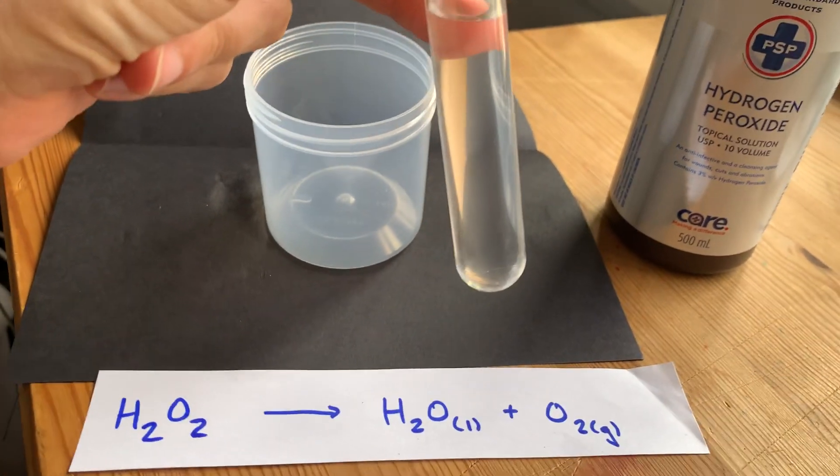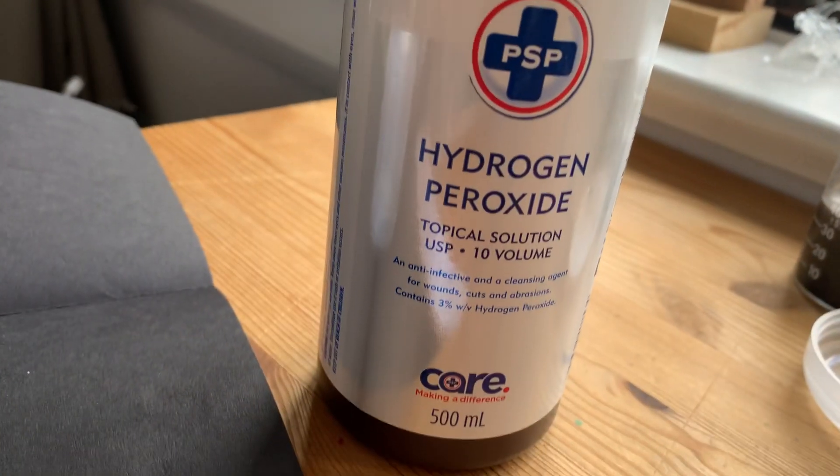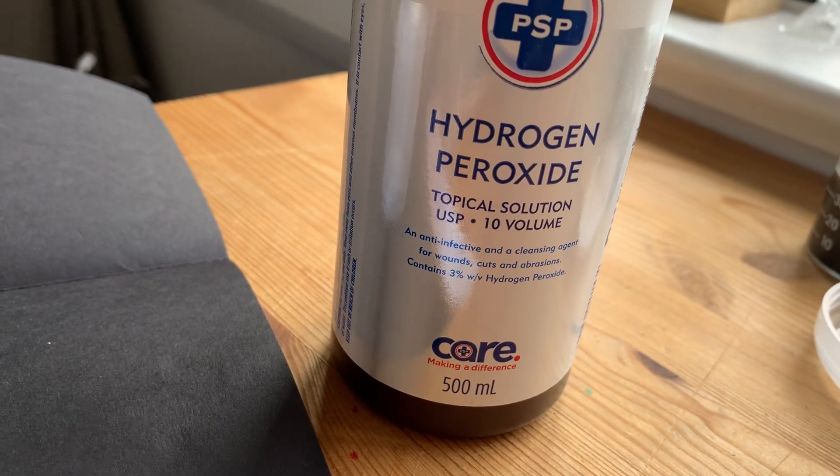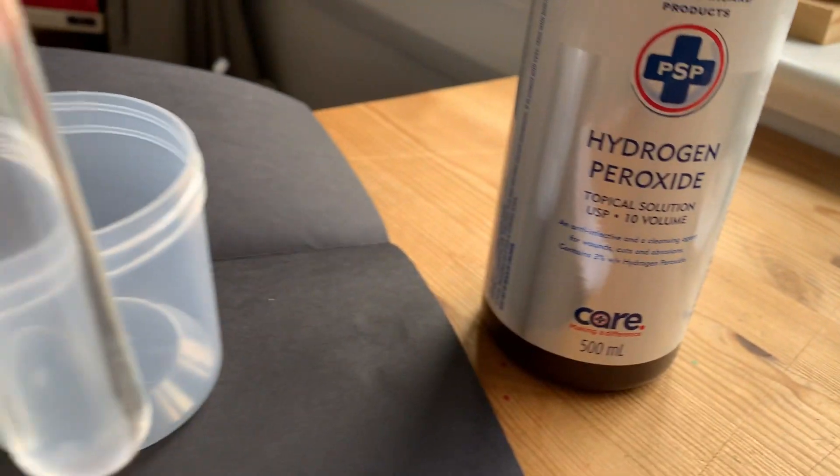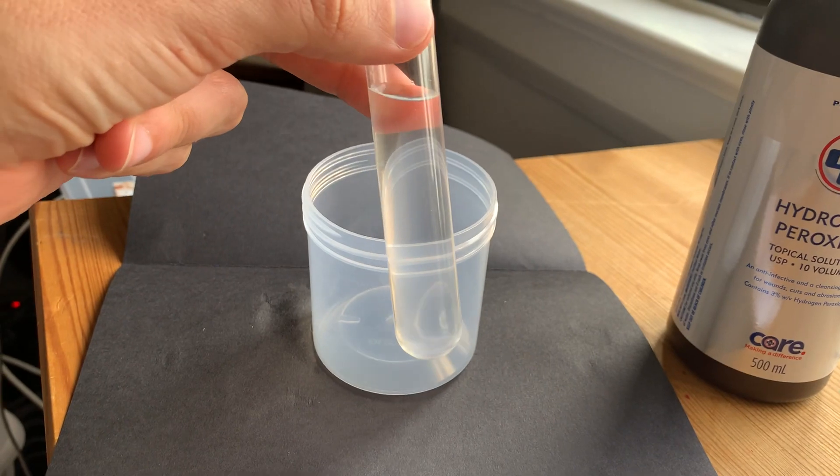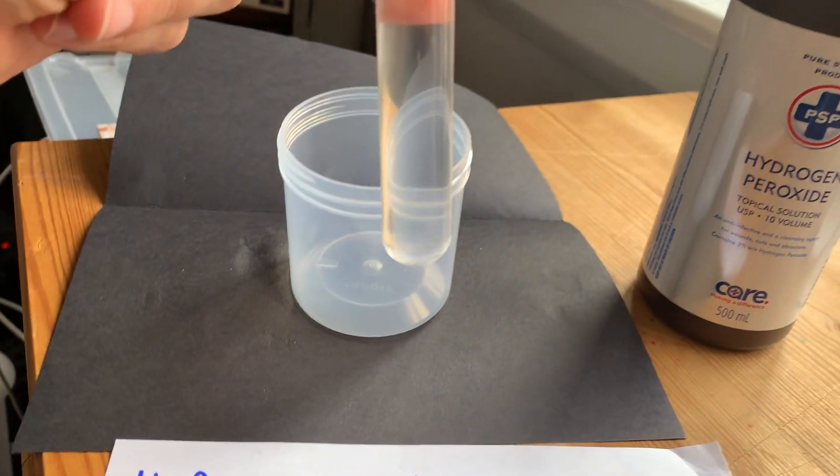In this test tube, I have hydrogen peroxide that I got out of this container. It says 3% weight by volume, which means there's 3 grams of hydrogen peroxide in every 100 milliliters of solution.